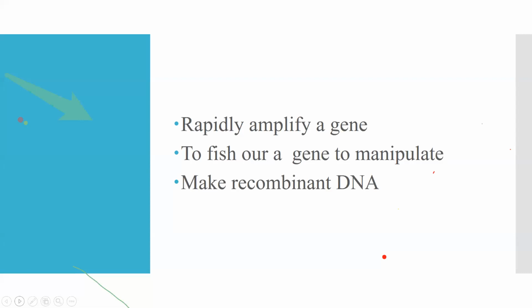You use a thermal cycler, an instrument that can rapidly control its temperature. You have a temperature at which the denaturation of the DNA will happen. Then there will be an annealing temperature set where the primers will come. So why do we need primers? Because the DNA polymerase cannot start.